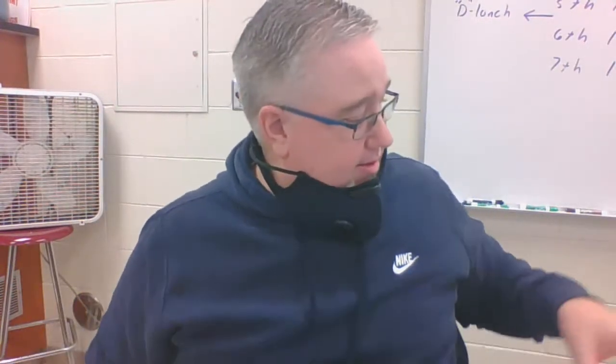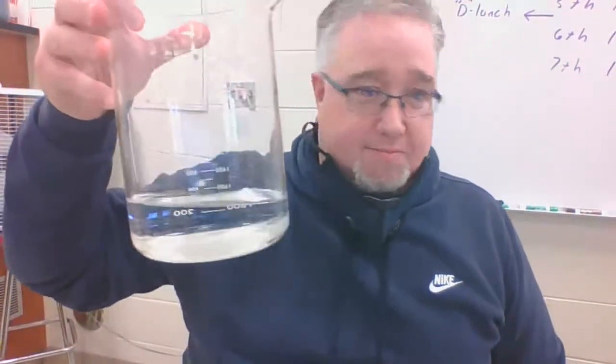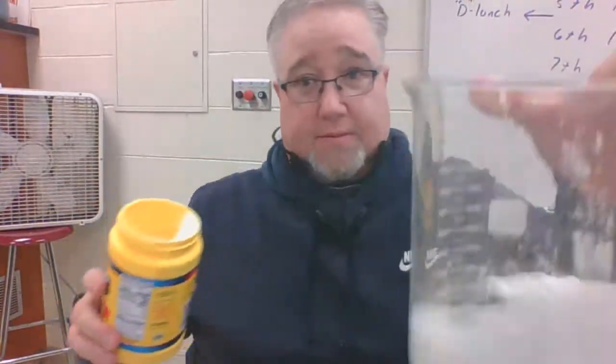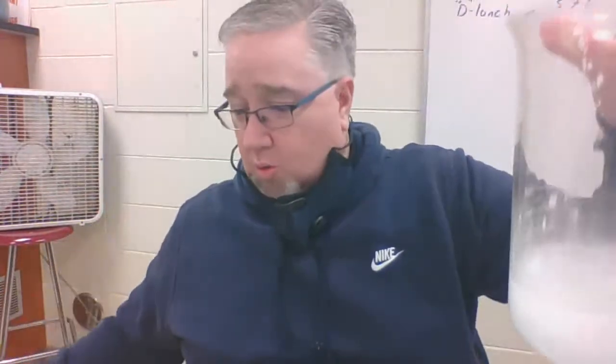Now, what's interesting about iodine is it acts as what we call a chemical indicator. It actually indicates the presence of a certain substance. And that substance is starch. So, for example, I'm just going to use this leftover water that I had. I'm going to put some cornstarch into this beaker. Oops. So here we have some cornstarch and water.